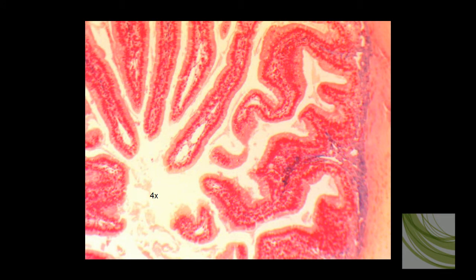This is the second slide we're going to look at, and here we're starting at the 4X objective. This is the lumen, and the simple columnar is along the edges of these villi, and villi are used to increase surface area.